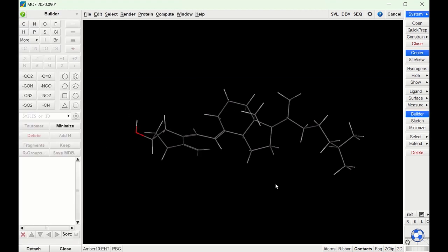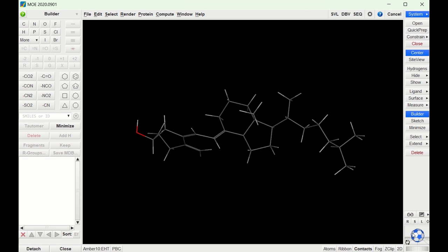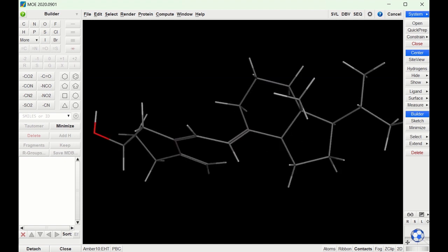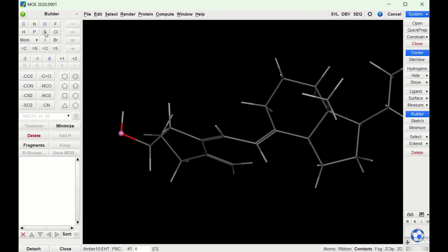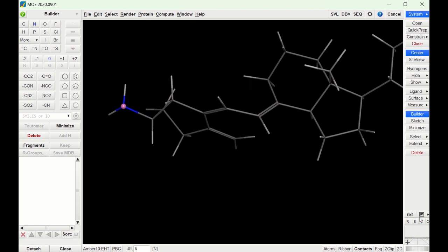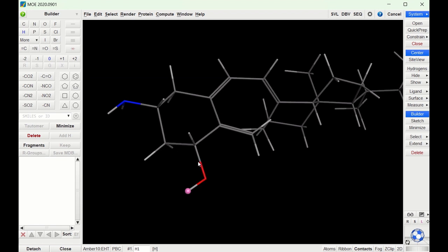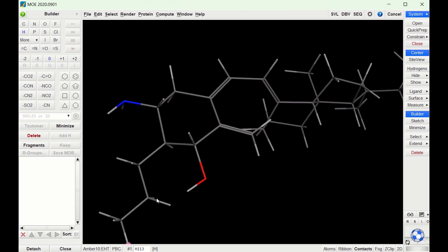I can then click the Builder tab over here and it brings up all these tools I can use to edit the structure. So let's say I want to start by deleting this group up here — if I click this carbon and then click the Delete key on my keyboard I can just start deleting some of the carbons here. Let's say then I want to change this OH group over here to an amine: I click on the oxygen and then click the nitrogen icon and it'll change that to an amine. Then let's say I want to add an OH on the opposite side of this ring. On this carbon there are two hydrogens shown — if I click one of those hydrogens and press the oxygen icon it'll change that to an oxygen. Since I chose the hydrogen that's pointed backwards, it added the oxygen pointed backwards. If I want to add a carbon chain here I can press on this hydrogen, add a carbon there, and continue adding carbons as long as I want that carbon chain.